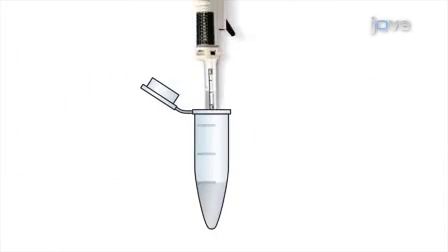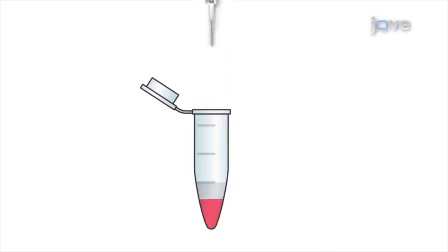Next, prepare the samples for PCR using the provided tubes that are pre-coated with nucleotides, primers, and internal control DNA.